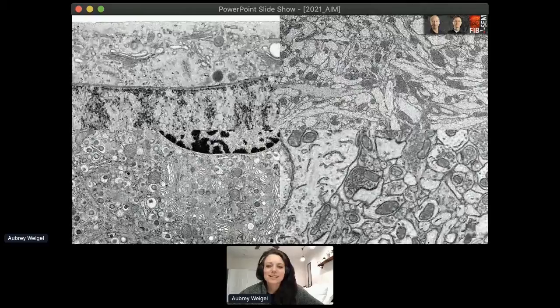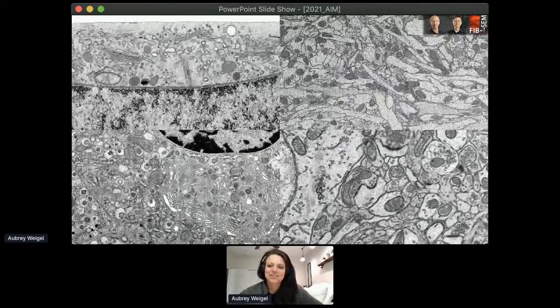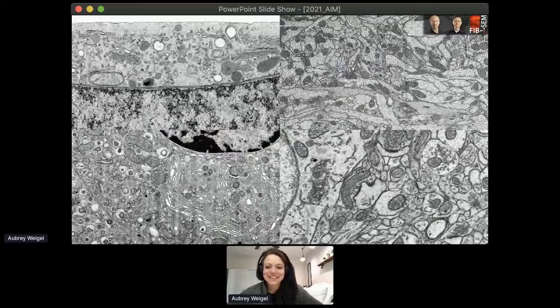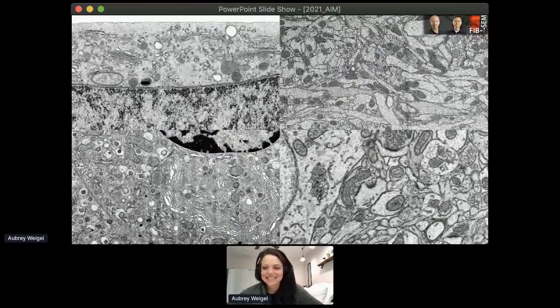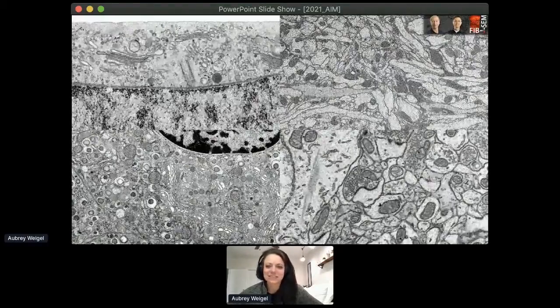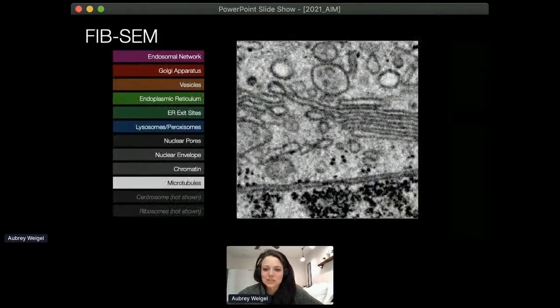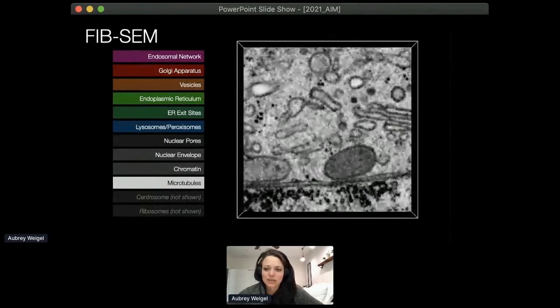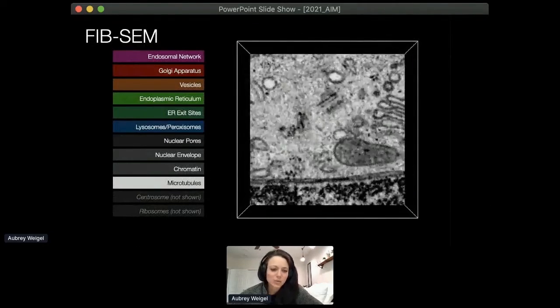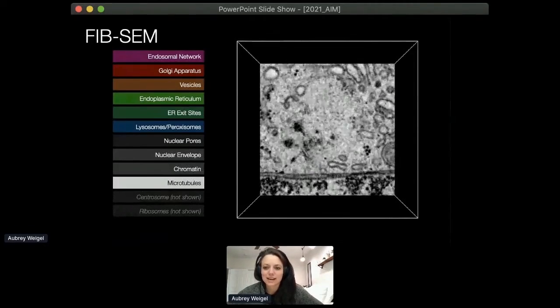Now, these data sets are absolutely rich with information and they're just begging to be extracted. However, because they are so big and so detailed, extracting that information is a mountain of a task in and of itself. So, for instance, if we zoom in here, and take a closer look, this is a roughly 1 cubic micron volume centered about the centrosome in a HeLa cell.